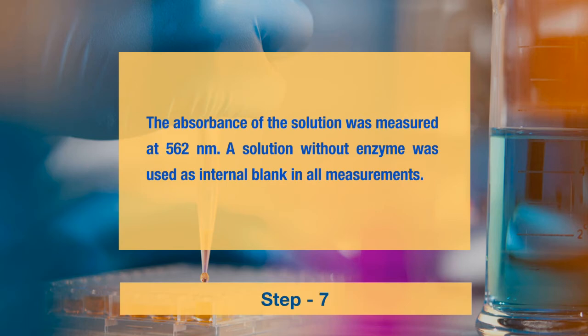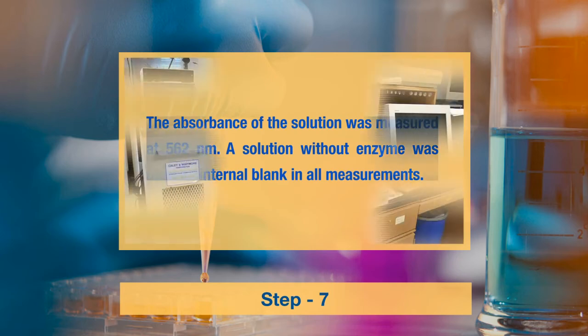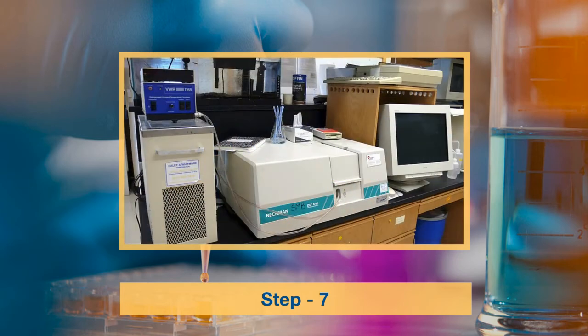Next, the absorbance of the solution was measured at 562 nanometers. A solution without enzyme was used as internal blank in all measurements. 3 replicate data were recorded from 3 vials containing the same enzyme and substrate concentration.